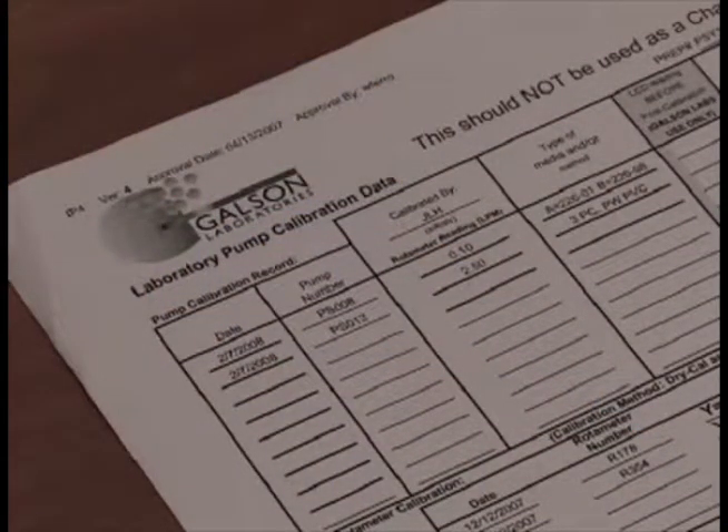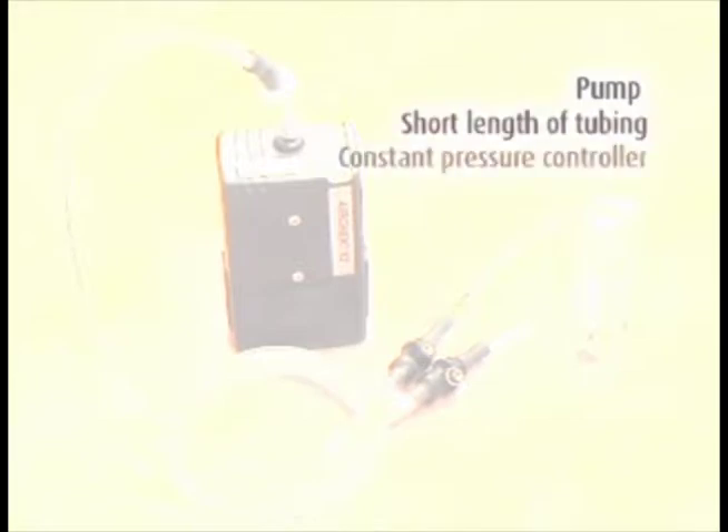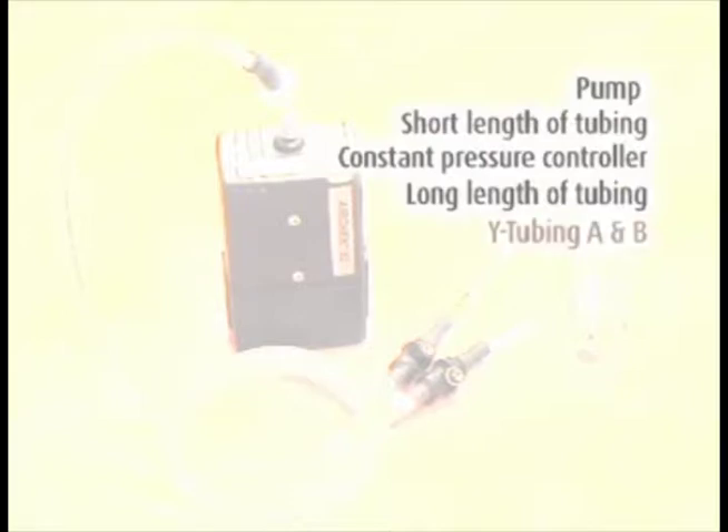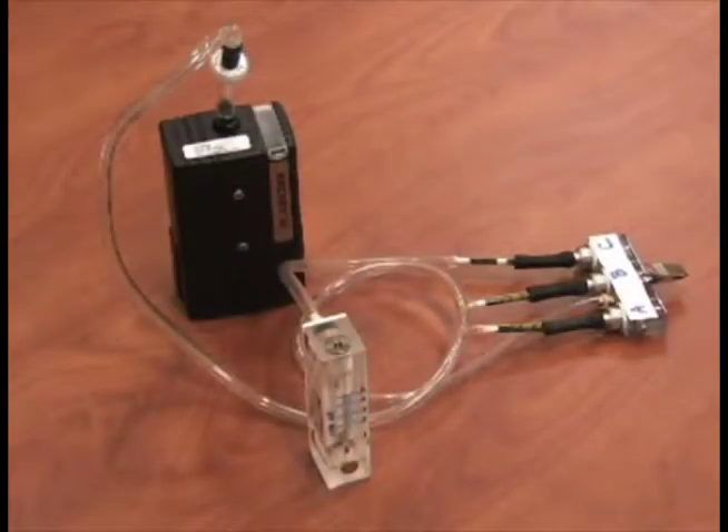All pumps have the lab calibration information on the pump calibration data sheets provided. Set up the pumps with the correct media in line with the field rotometer as shown. The order of the components for dual splitter calibration is: pump, short length of tubing, constant pressure controller, long length of tubing, Y-tubing marked A and B, two adjustable low flow holders, sorbent tubes, and rotometer for calibration.